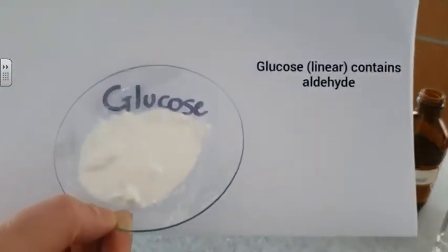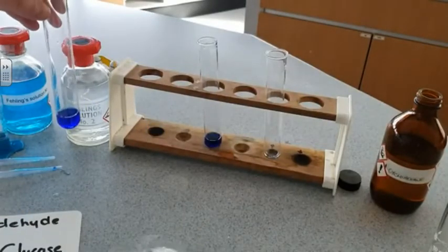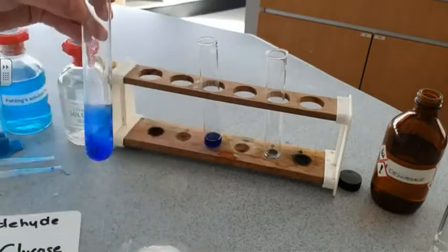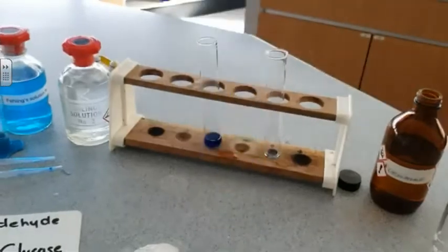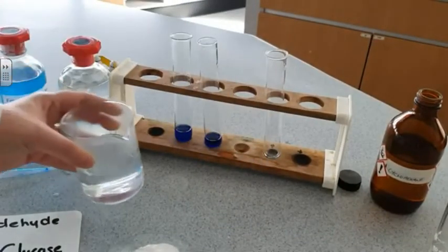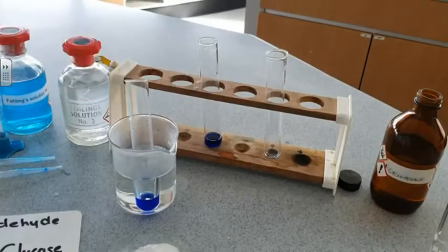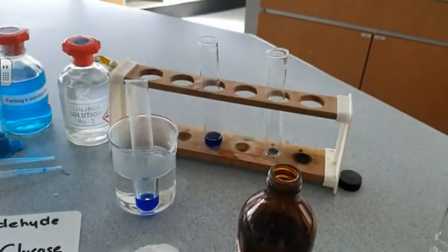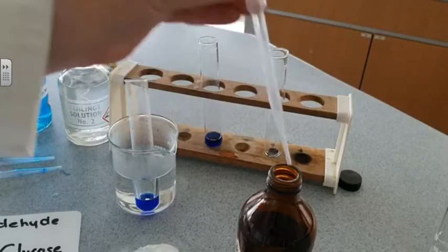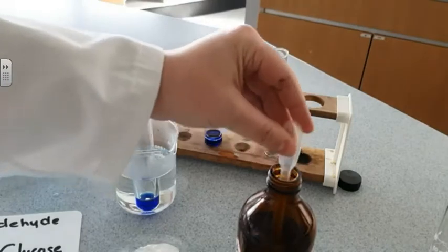And we're going to use the linear form of glucose. The linear form of glucose has an aldehyde group at the end. So we're just going to add a little bit of the glucose into the Fehling's solution there. And we're going to add it to some hot water, because for the oxidation of an aldehyde you do need to warm your solution. And then in our second Fehling's solution we're going to add some cyclohexane. So I've got some cyclohexane to go into our second batch of Fehling's.